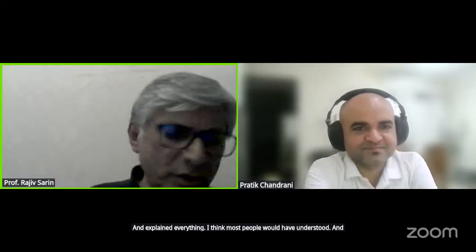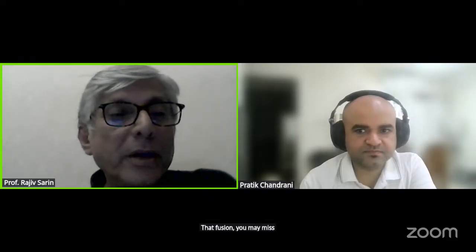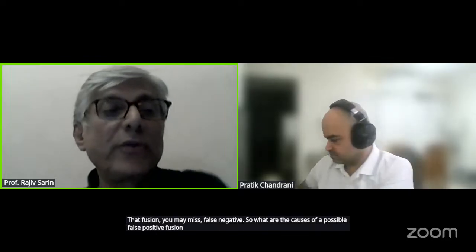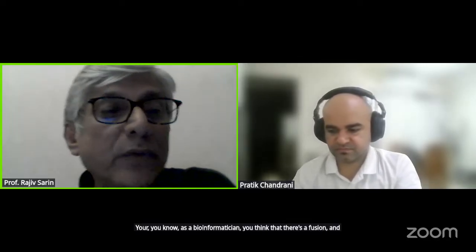And I'll ask just one question before I take up audience. You talked about that fusion you may miss, false negative. So what are the causes of a possible false positive fusion? That means there is no fusion, but you, as a bioinformatician, think that there's a fusion and you don't have means for validation.